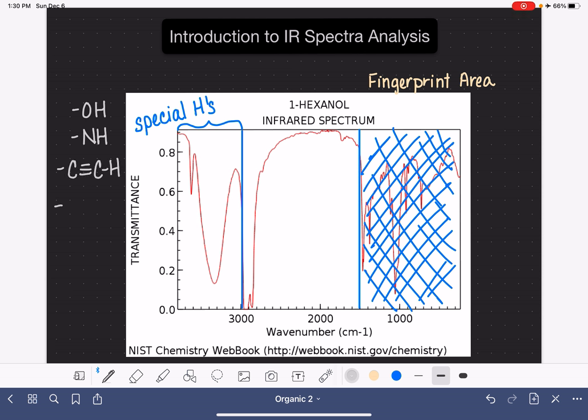And sometimes if we're lucky, if we have a vinylic hydrogen, that would be a hydrogen that's on a carbon-carbon double bond. If we have a vinylic hydrogen, we might be able to see that as well. It's hard to see the vinylic hydrogens. So don't be surprised if you have a molecule that has a vinylic hydrogen and you can't see it over here because it's hidden by something that's pretty normal. But the OH, NH, and terminal alkyne hydrogens are always very identifiable in this area.